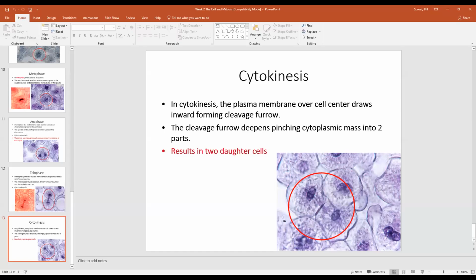Okay. Now, the next thing we want to do is take a look at cheek cells. This is a very simple process, and it's worked all week. You take a microscope slide like this. The microscope slide is going to have a white frosted area on it that says specimen. You don't do anything with that. You want to use the clear portion. The reason I'm saying this is because I had people in one of the labs put everything on the white frosted area. So anyway, you're going to take a toothpick.